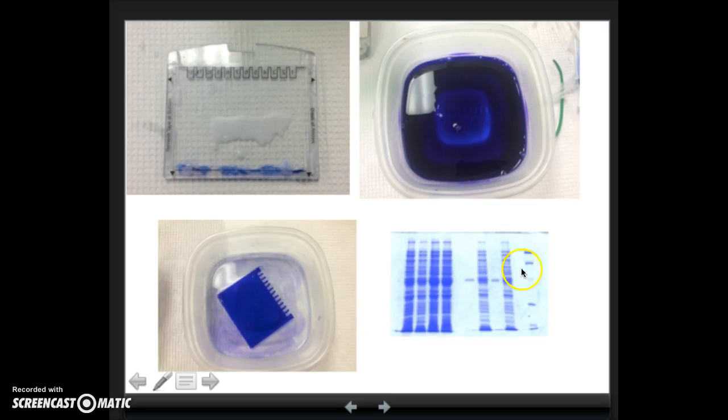Once we've done that, we should get something that looks like this. Each lane has proteins in it. Notice these first four lanes have a lot of proteins because there's a lot of bands in each of those lanes. These lanes over here have less protein. In fact, a couple of the lanes maybe only have one protein. At least we only see one band. And then we've loaded also a lane of standards. I'll talk about what we do with those standard proteins in a minute.